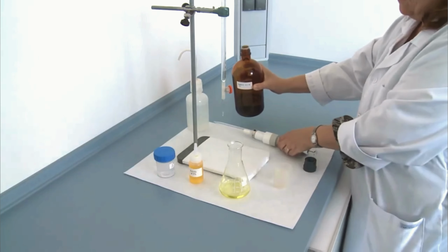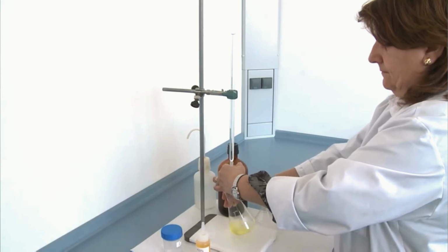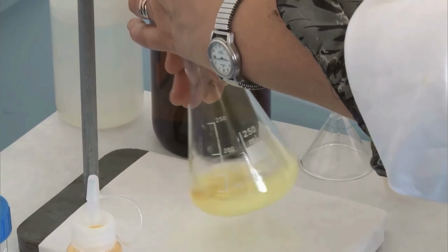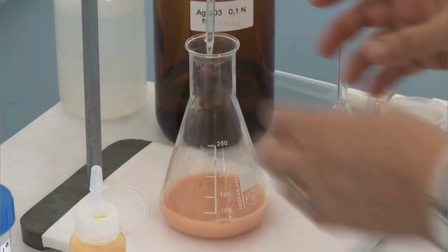Fifth, the solution was titrated with standardized silver nitrate solution. Sixth, titration was continued until persistent brick red precipitate was formed. Seventh, burette reading was recorded to nearest 0.05 ml. And lastly, analysis was repeated in triplicate.